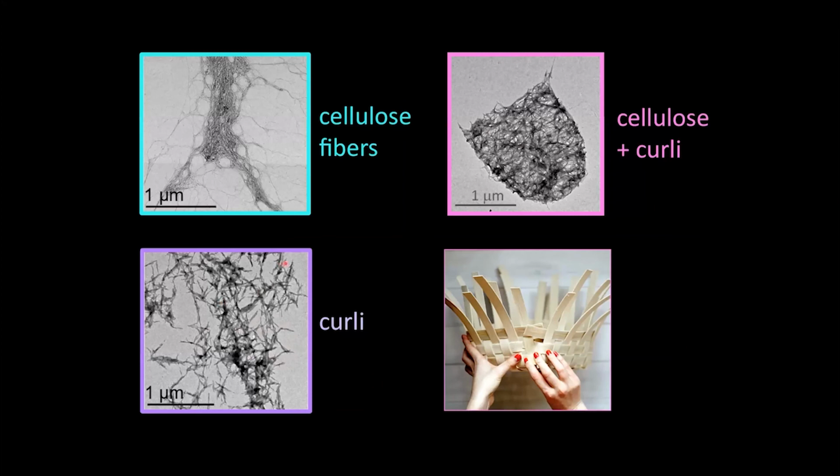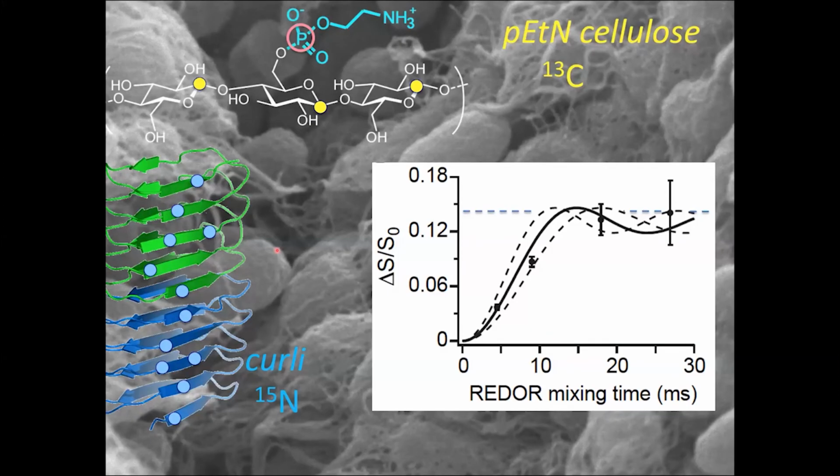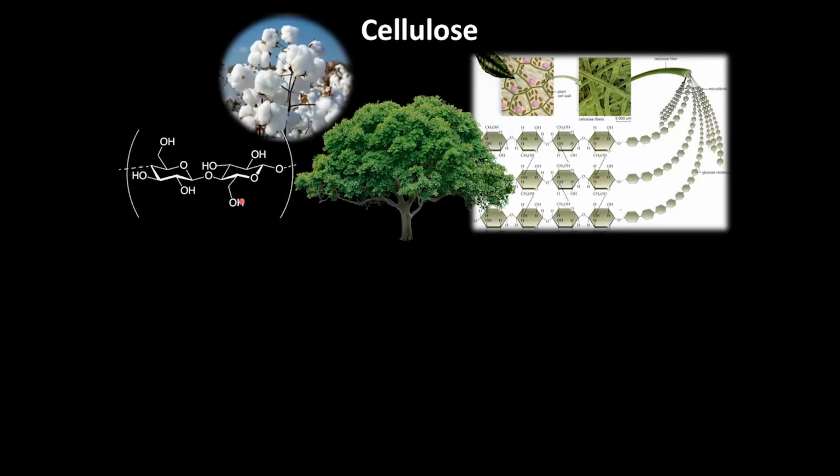And of course, moving onward, we're really interested on the solid-state NMR side to understand the design principles and how bacteria take these two different types of insoluble fibers, modified cellulose fibers and curli, and elaborate these connective, cohesive, kind of elastic structures made of the curli and the cellulose put together in the way a basket weaver would weave a basket together. And we're doing this through a variety of spin diffusion methods. Also, REDOR can help stitch together the contacts between these really heterogeneous non-crystalline assemblies.